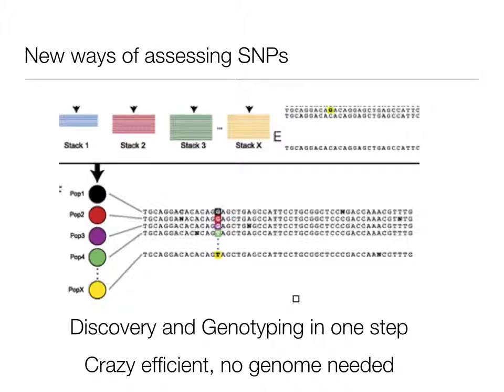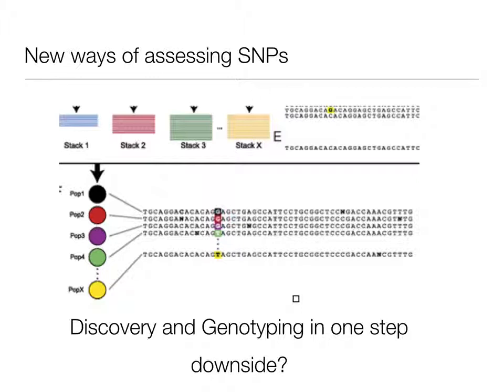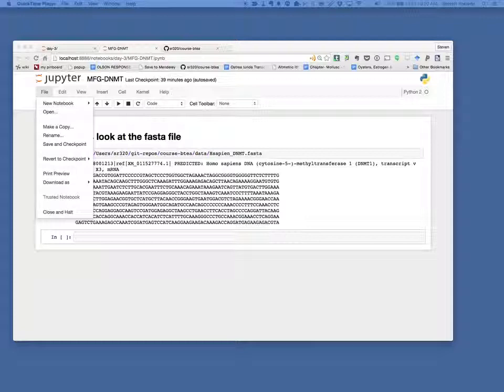Yeah, for RADSeq exclusively. I mean, that's what it's made for. You wouldn't even use it for the gene stuff. This is just part of what's inside. So when we do RADSeq stuff, we use Stacks. So that's, again, Stacks. You could do it. It's just like BLAST. It's a couple more programs, but U stacks, C stacks, input, output, a couple variables, and follow the instructions. So the same kind of interface.